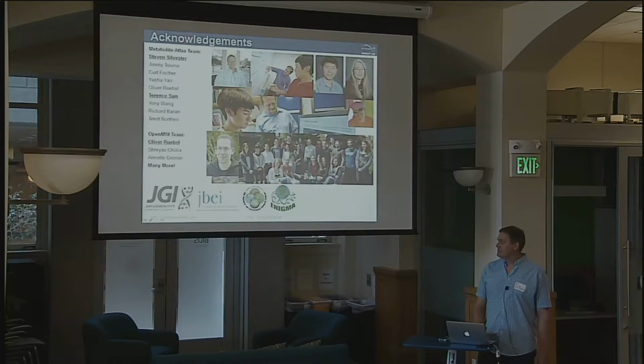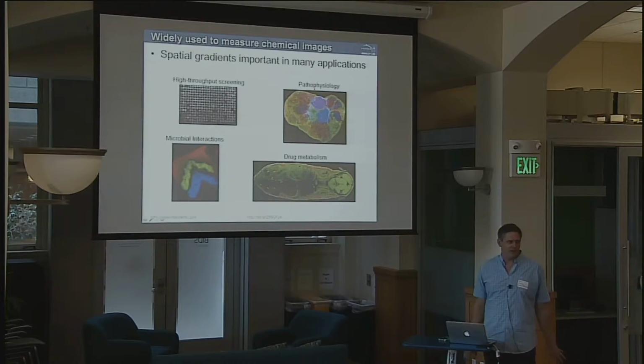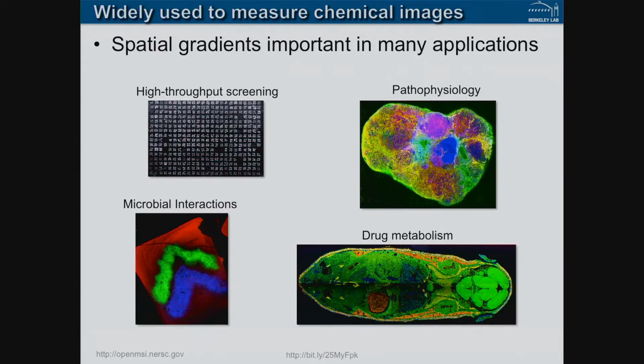The Open MSI team is built mostly by myself and Oliver Rubel. Most of these people are data generators that we work closely with, and we teach them all how to program. Everybody we work with uses these IPython notebooks to analyze their own data with minimal help from me.